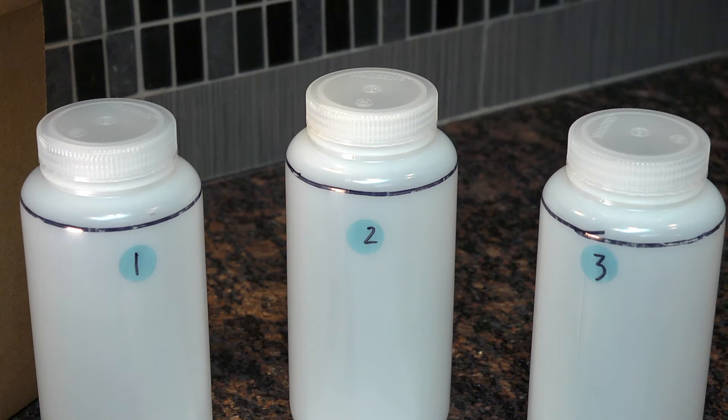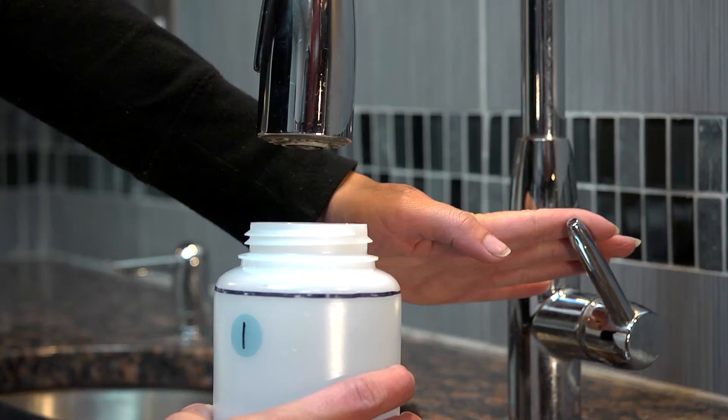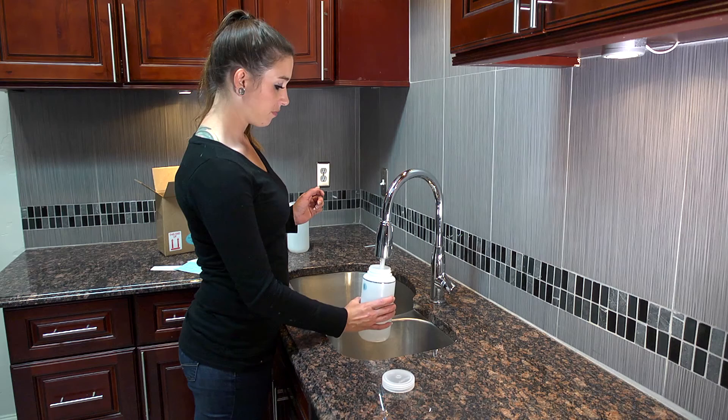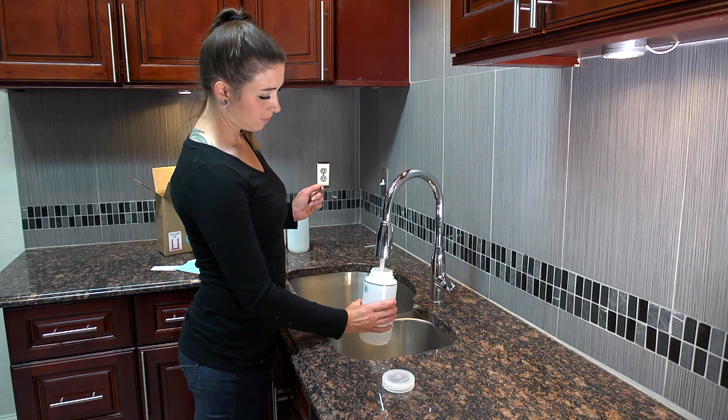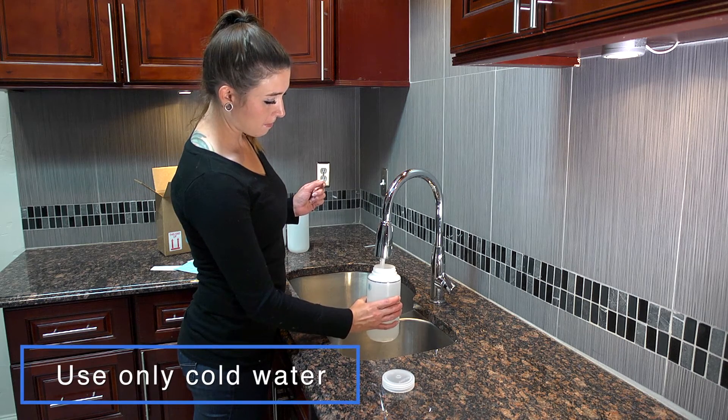Set the bottles next to the sink in order: one, two, and three. Remove the lids and have a timer on your phone or watch handy. Place bottle number one under the faucet, turn on the cold water, and fill the bottle to the black line. Make sure to use only cold water.